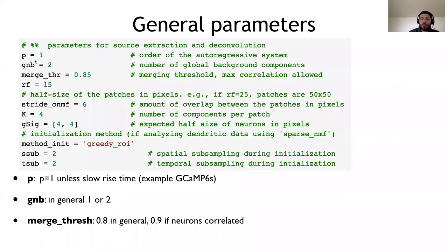I want to explain a little bit about the parameters because this can be useful for what you do in your experiments every day. The parameter P is the order of the autoregressive system. P equal one represents the case of a fast indicator and slow frame rate. Like for instance, if you take 30 Hertz with GCaMP6F, that's a perfect approximation. And instead, when you have a slower indicator and faster frame rates, then you want to use a P equal to two. What do you want to check is whether it will require just one frame for the calcium transients to reach the peak or more than one. So let's say that you have GCaMP6S for instance, at 30 Hertz, and maybe you will need two or three frames before you reach the peak. In this case, you want to use P equal to two.